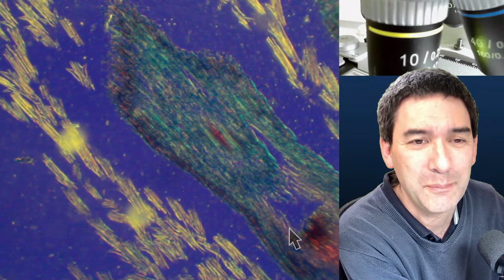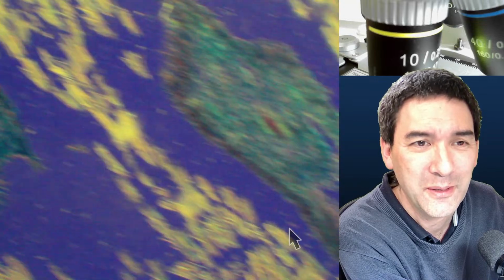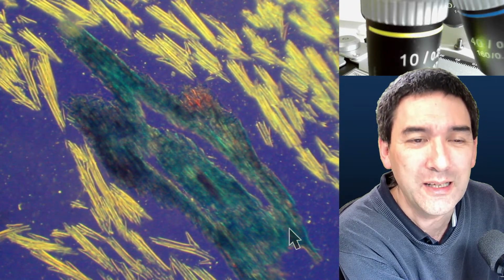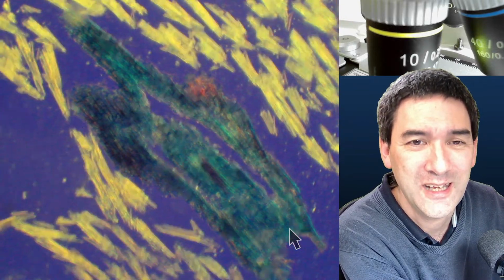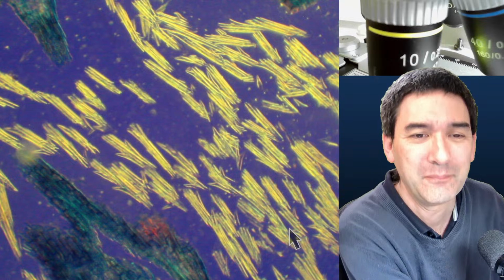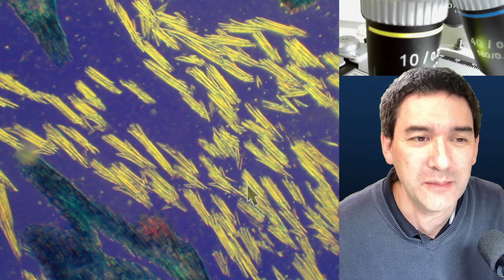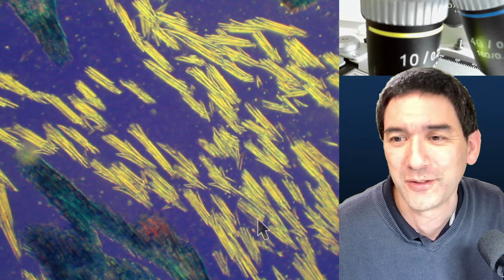I like this example here because this illustrates a little bit that even on the same slide, you see the different parts of the specimen interact with the light differently. In this case, those tiny little hairs seem to interact with the light much better, and they reflect it much better, but those down here not so much.